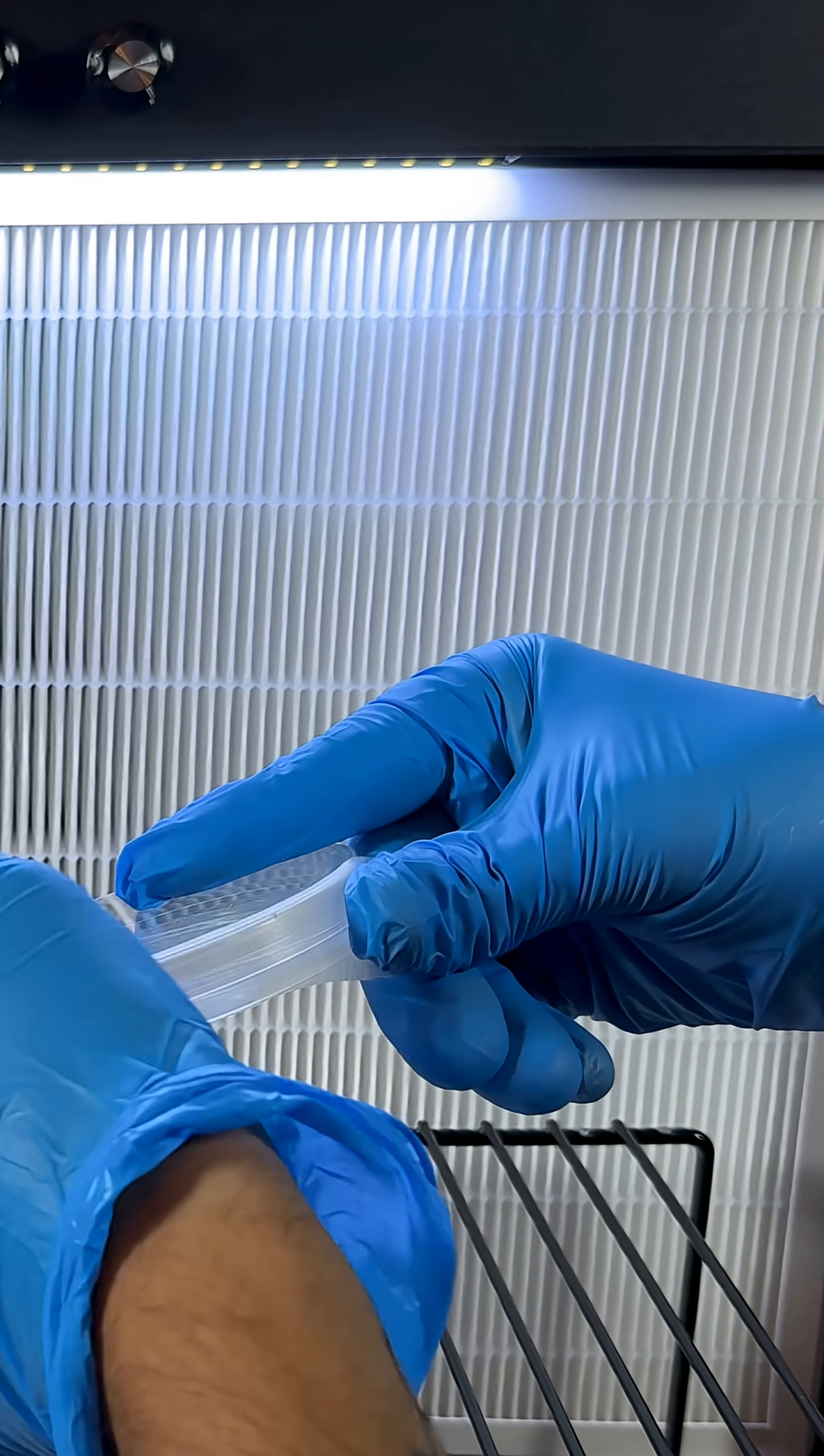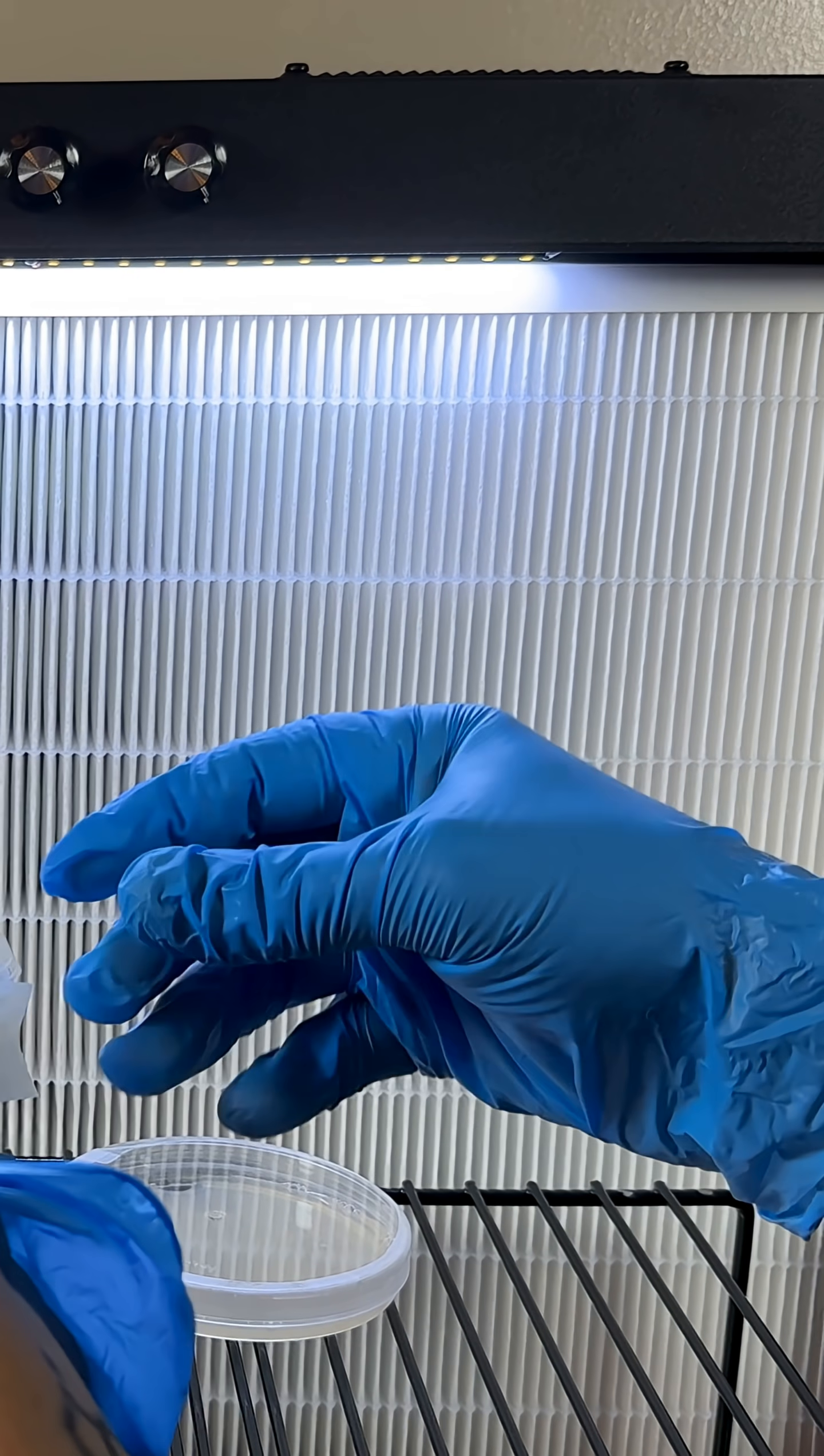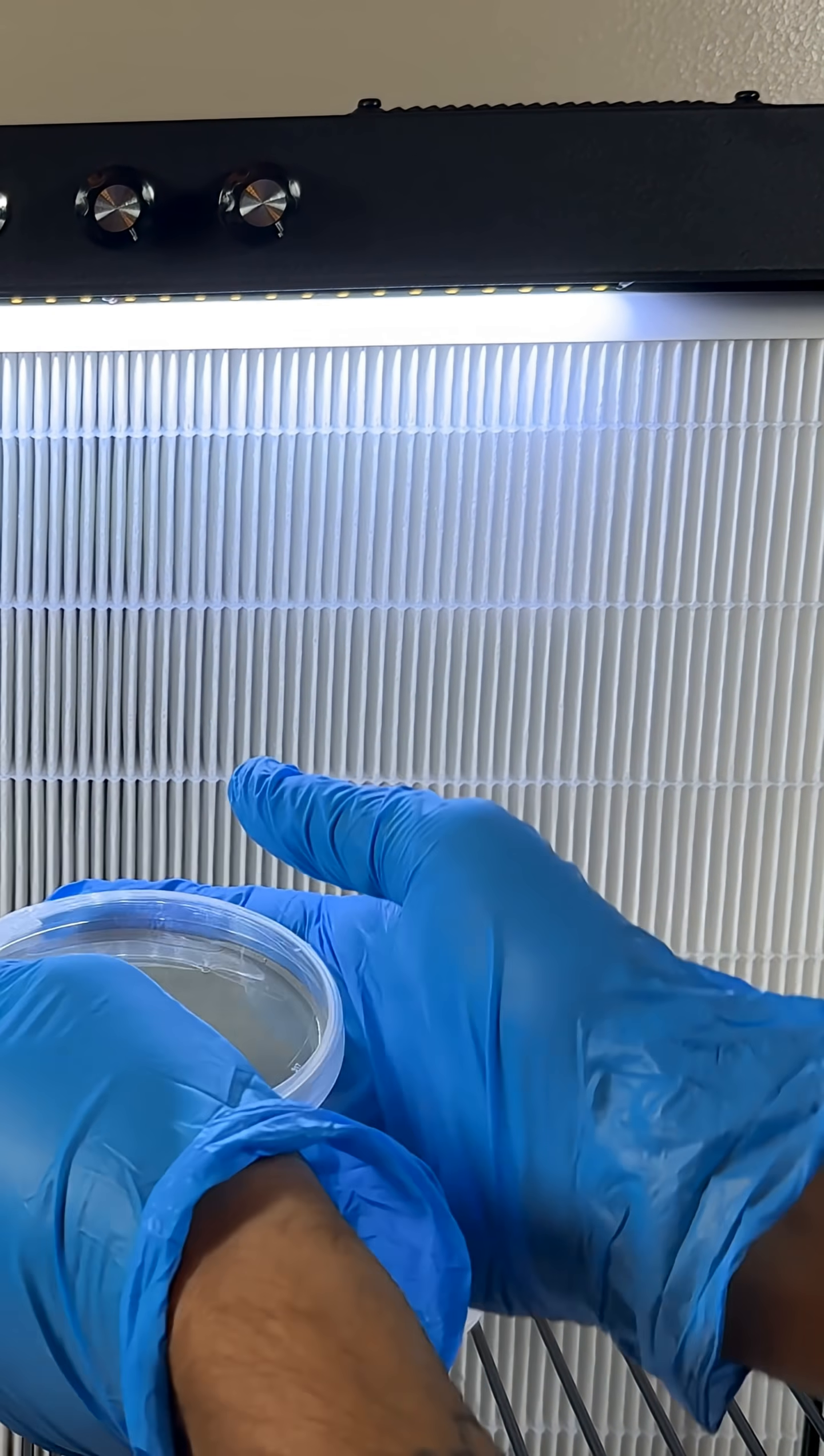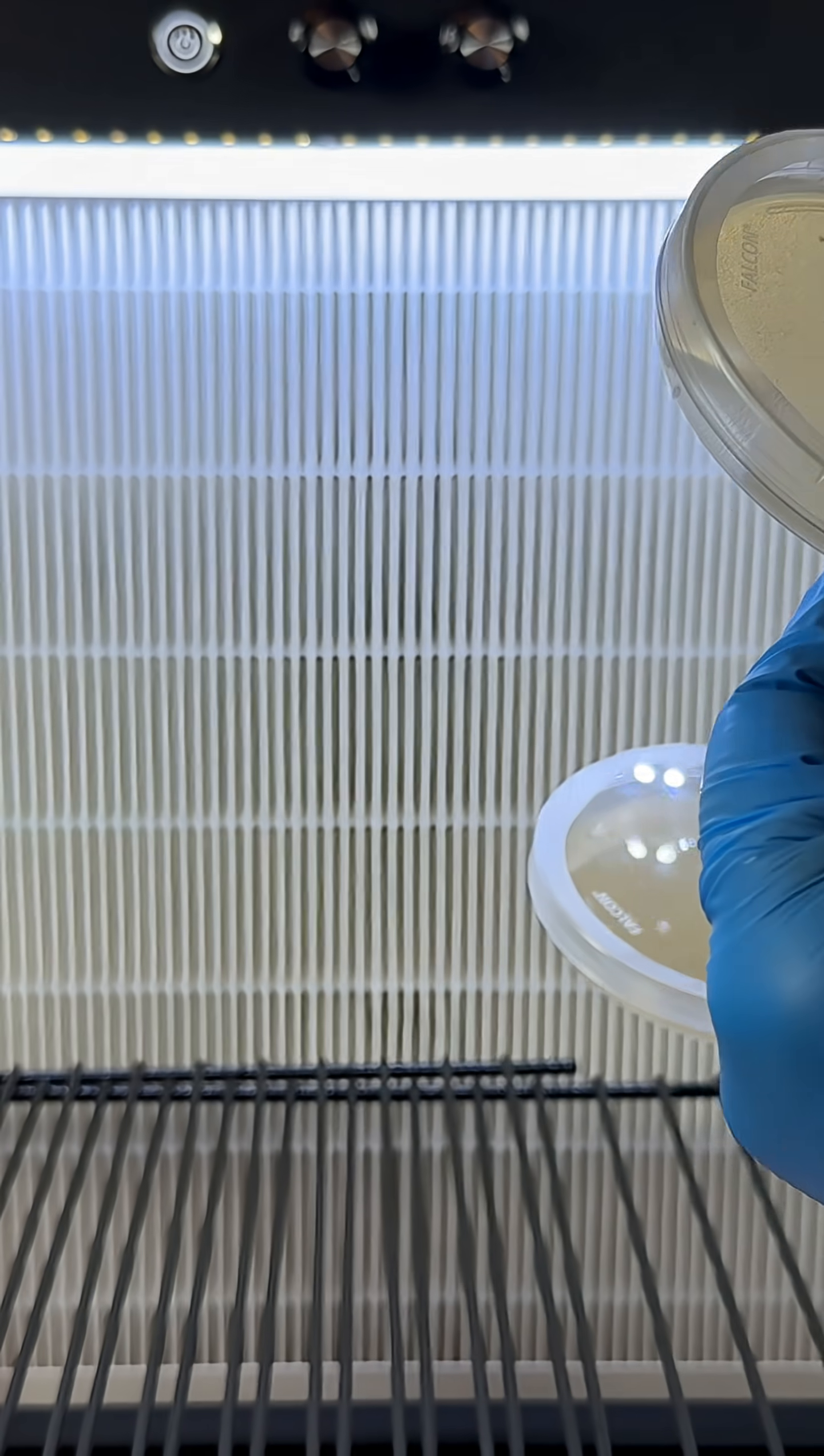After incubation, the agar plates showed no signs of contamination. No bacteria, yeast, or mold grew on the agar plates, which signifies that the laminar flow hood is sufficient.